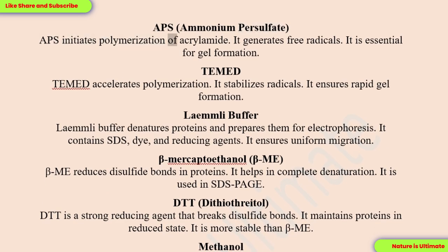APS initiates polymerization of acrylamide. It generates free radicals. It is essential for gel formation. TEMED. TEMED accelerates polymerization. It stabilizes radicals. It ensures rapid gel formation.